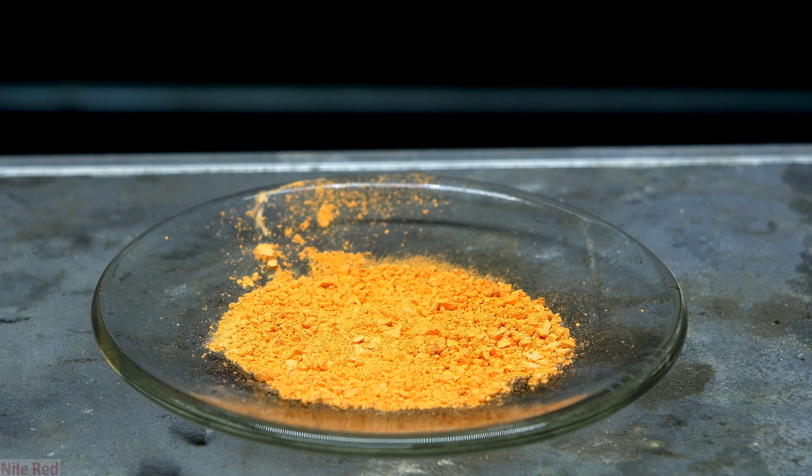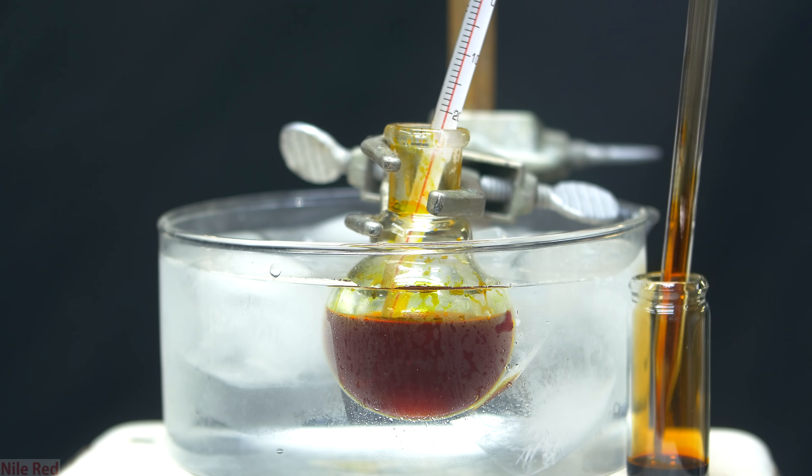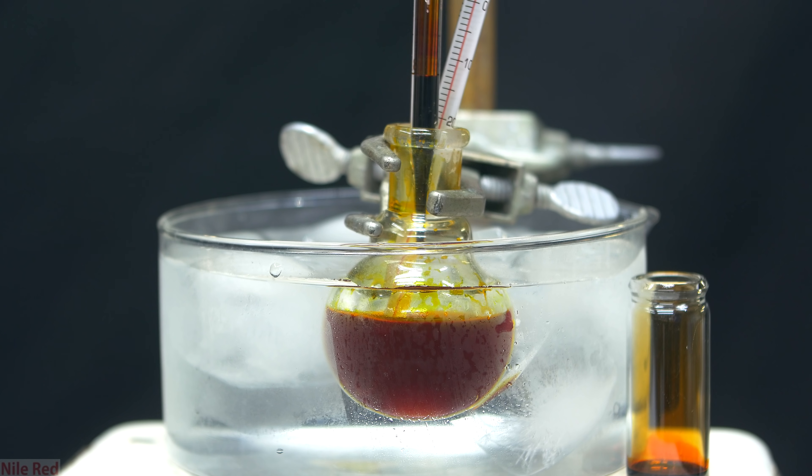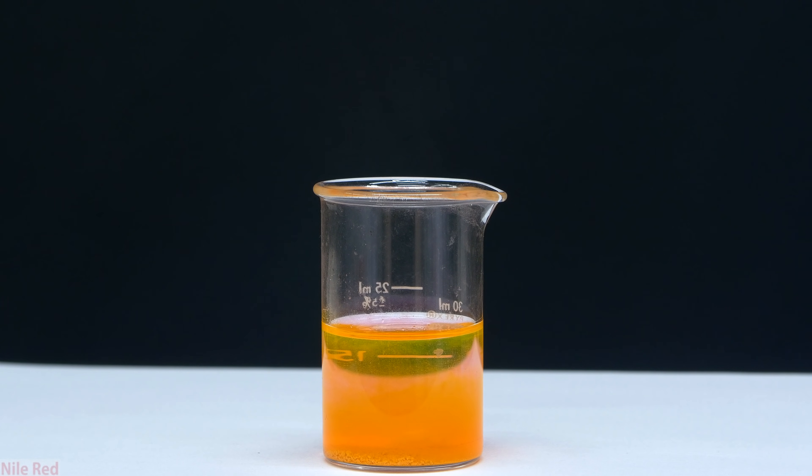Today we're going to be making eosin-Y, which is commonly used as a biological stain. When it comes into contact with things like proteins or muscle fibers, it stains them a dark red or a pink, which makes it easier to examine them under a microscope. The eosin is quite easily made by reacting fluorescein with bromine, both of which we've made in previous videos.